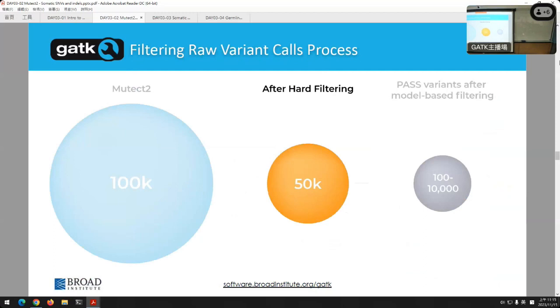As we move on to hard filtering, well, we mentioned hard filtering. You just did some hard filtering in your exercise. We set here too in our pipeline reasonable thresholds and say, okay, whatever we have with confidence, let's do a level of just hard filter it out here, okay? Let's pass it through once. Let's just toss things that we don't think we're confident enough in. Remember, in this case in particular, even more than basic germline calling, we're really trying to minimize those false positives here. So even after we come out of our modified haplotype caller in MuTect2, then we do another phase of hard filtering that would further whittle down. Like if you start with 100,000 potential variants there, we might get down to 50,000 at that point, just hard filtering.